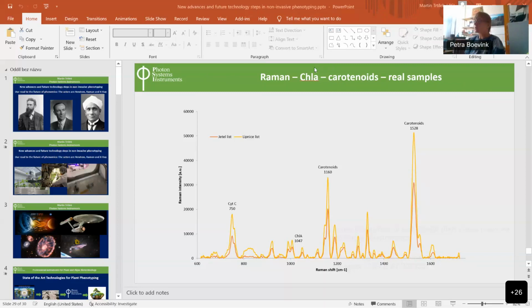Yeah, I was just wondering about the purity of spectra, in terms of the potential effects of complex environments and biological conditions. So when you're trying to set up reference spectra and things like that, how does that work? You mean Raman spectroscopy now?